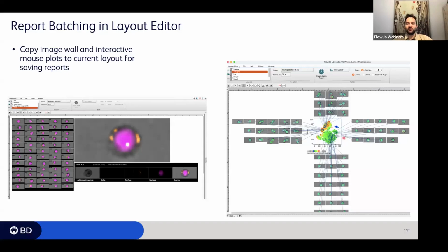So you can really define nicely the t-SNE embedding or UMAP embedding and so forth. That's something I'll be showing you later.